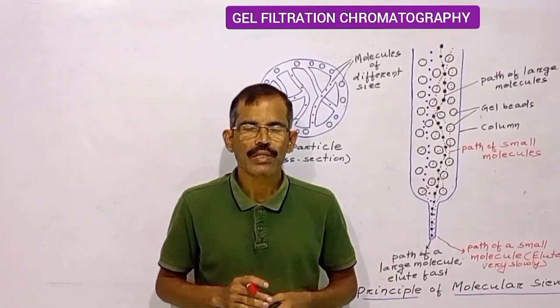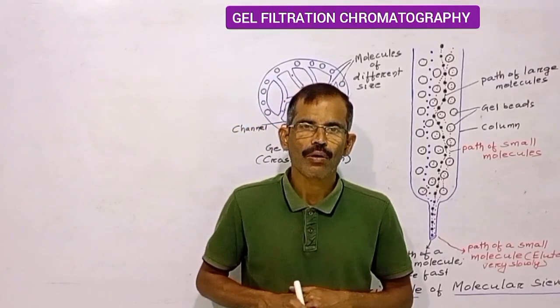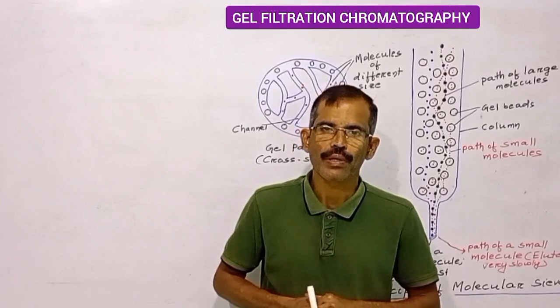Friends, today we shall discuss about the principle and the applications of gel filtration chromatography.